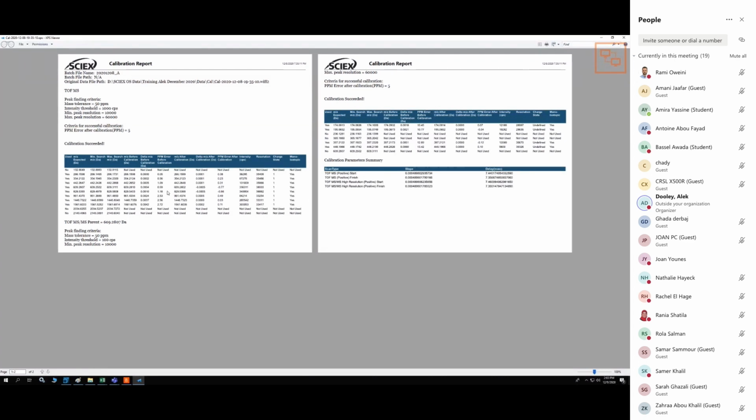And actually, the nice thing is you guys have a high mass compound, right? The antibiotic you want to look for, whatever today, is high mass. So we'll definitely see if we have a problem or not. But I would say that was fairly normal.